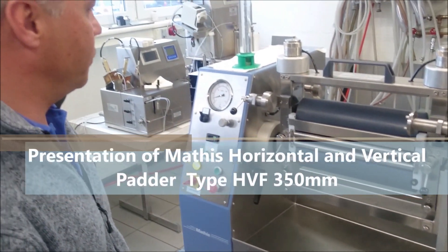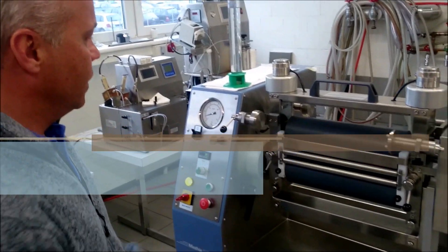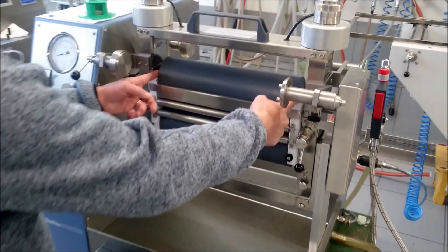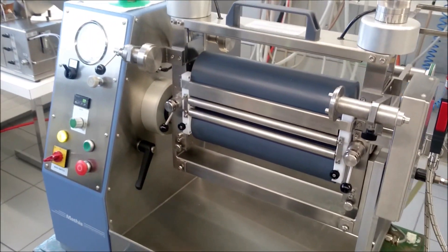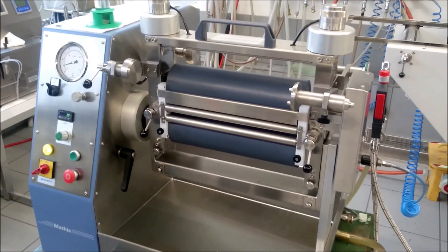Three possibilities work with the Mattis Adderer HVF. This size is 350mm. It's possible to work with samples about A4. It means 300mm.